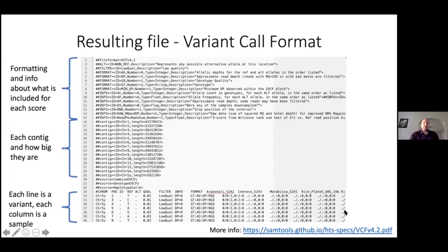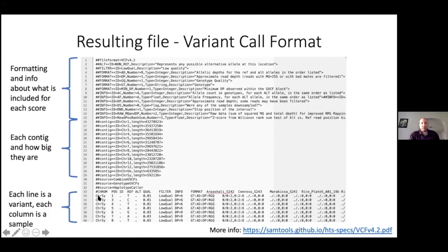The resulting file is that variant call format VCF. If you're not familiar with this file, you can find more information at the SAMTools GitHub page. Briefly, you have a bunch of formatting and information lines at the top that tell you what was called and what they represent. You have a block that tells you what contigs you have and how long they are — this comes from the CreateSequenceDictionary step. Towards the bottom, each line is a variant: you have your chromosome, base pair position, the reference and alternative alleles, and more information. Each column is for each of your individuals. Check out the SAMTools page to learn more about how these different pieces are coded and represented in this file.